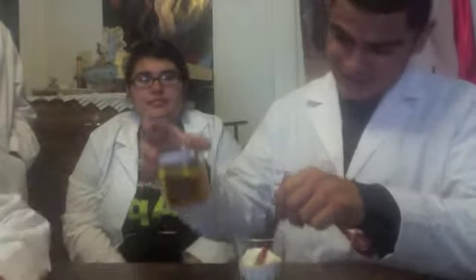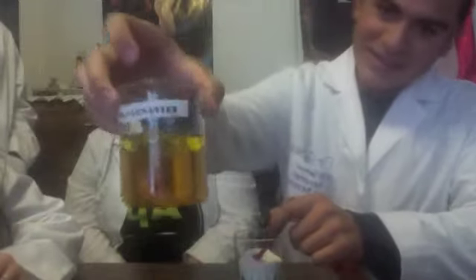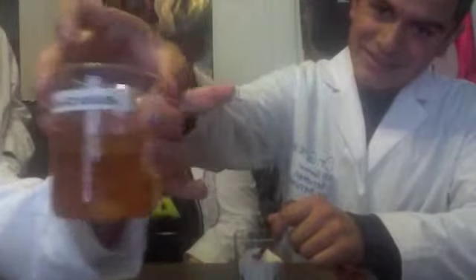As you can see, all that will be left is caffeine and ethyl acetate in the top layer. And it will be moving down, as you can kind of see, taking all the water molecules away. The tea beverage is no longer needed in this experiment.